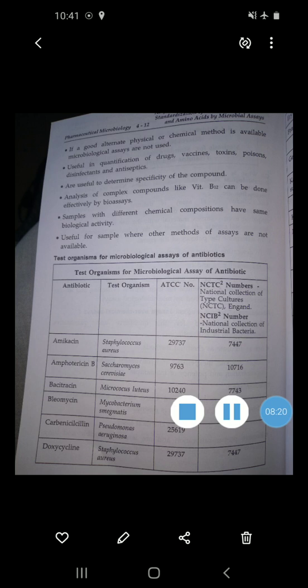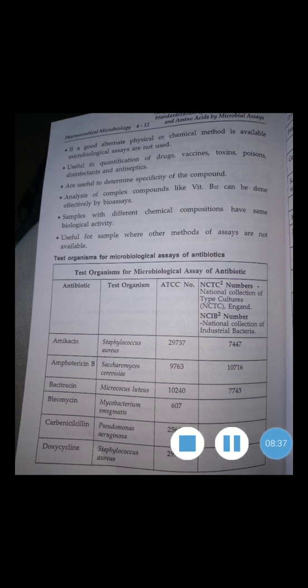Culture control, blank and medium control. In culture control, the tube contains inoculated culture medium. The blank is prepared like the culture control, to which 0.5 ml of dilute formaldehyde solution is added immediately.